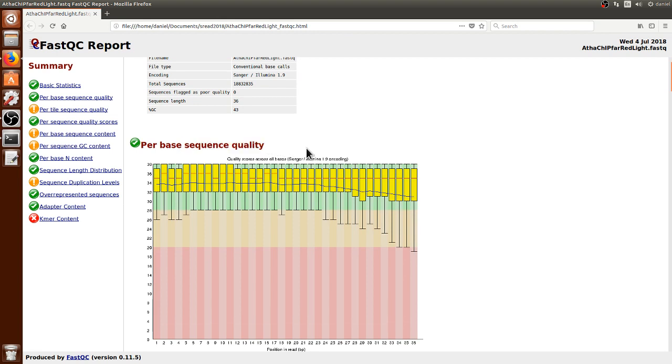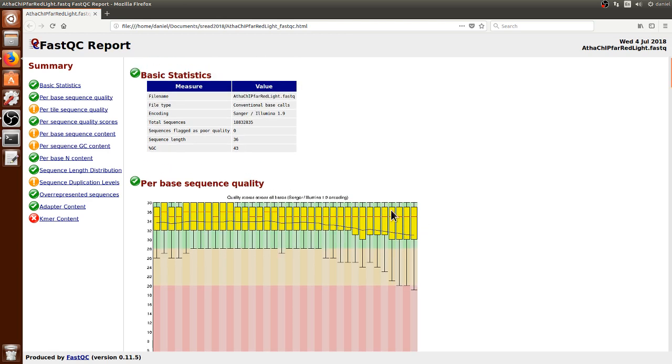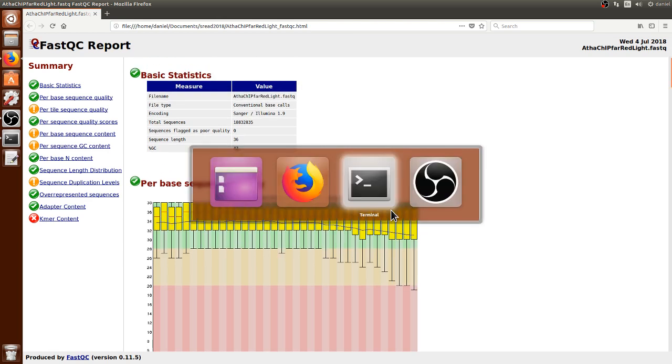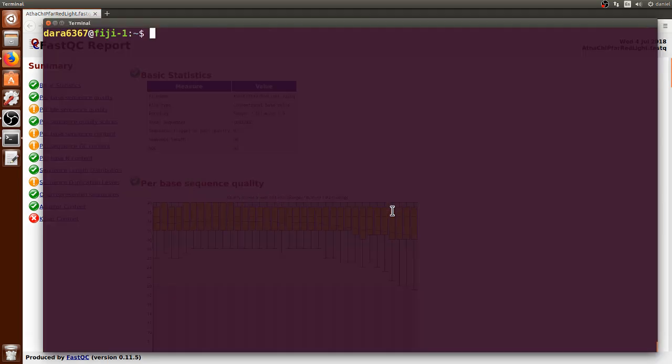Even though the sequence itself looks pretty good, you may want to improve the quality using Trimmomatic to trim some of the portions of the reads, which tend to fall in quality as the read position increases.